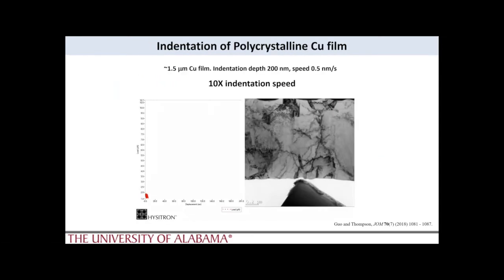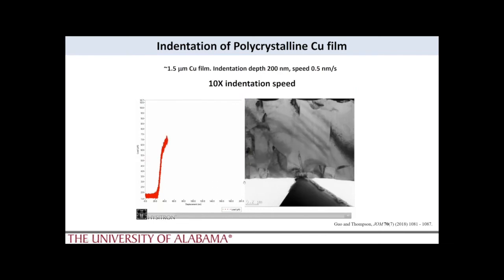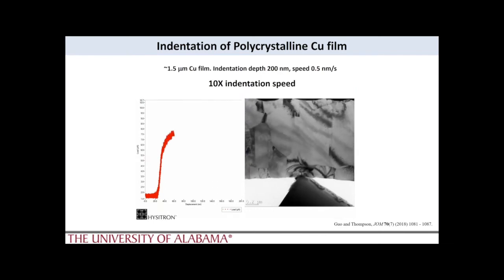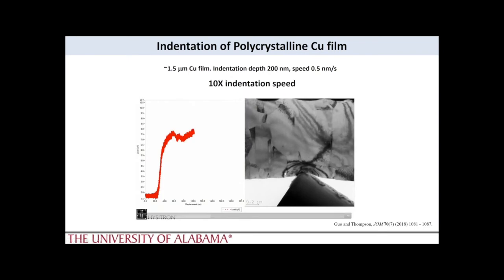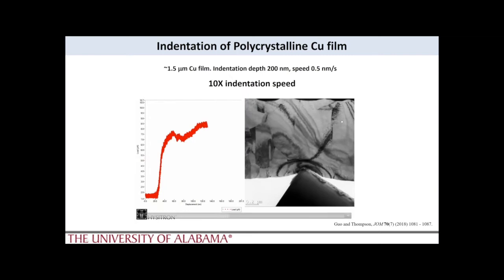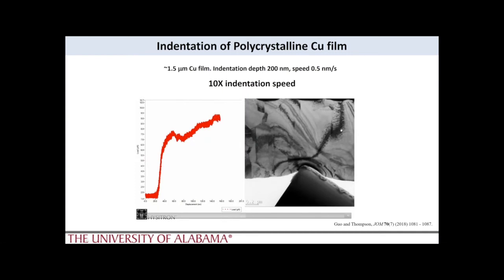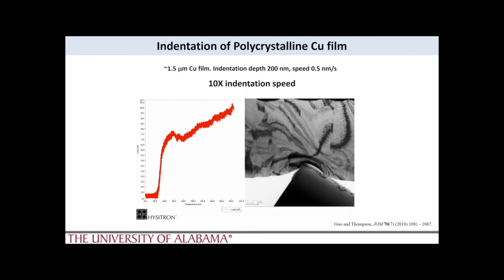Okay, so with that, let me show you the experiment I'm going to discuss with you. Here's our copper foil. We can see that we're loading the sample, and in this case, we see a lot of bend contours developing. We see dislocations that are now coming into contrast. We can see contrast forming under the indent. We now see dislocations appearing and emanating out of the grain boundary that separates these two columnar grains. And we're obviously collecting an enormous amount of contrast detail of how the material is deforming in the experiment.